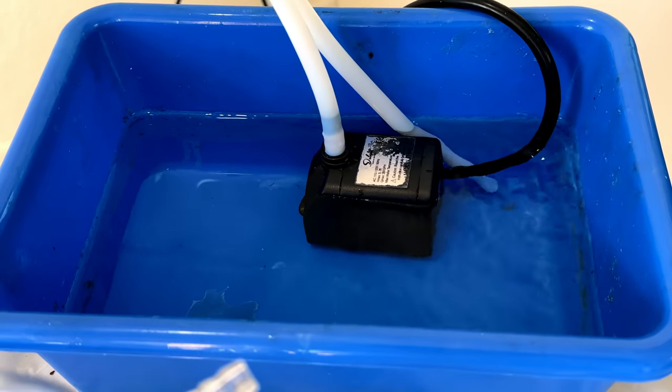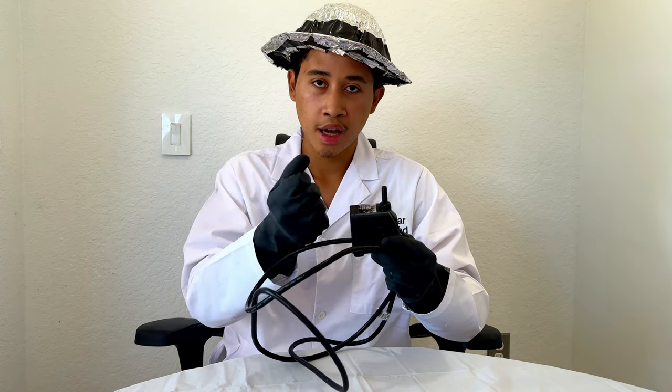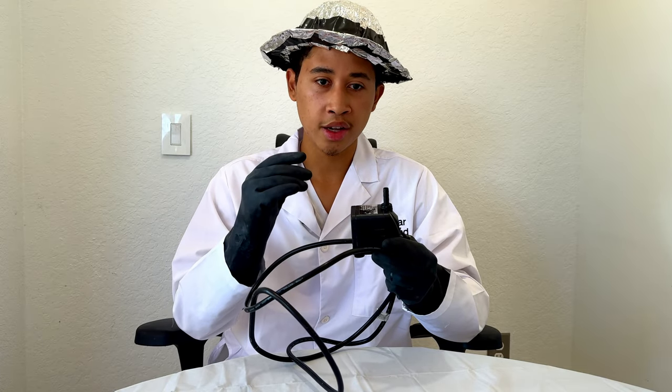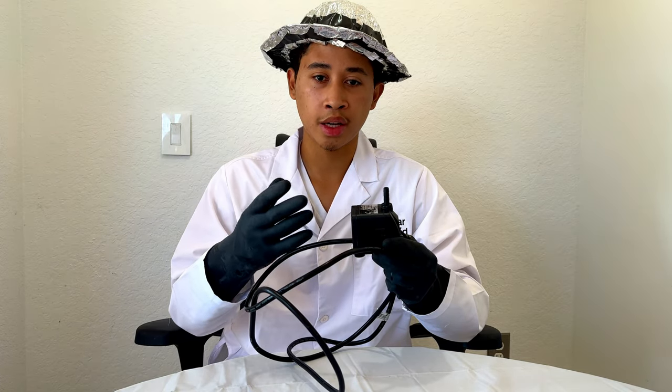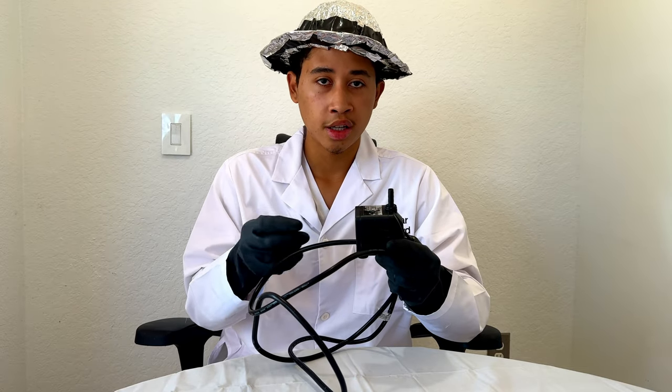This pump shoots 200 gallons per hour, which is more than enough speed for cool water to flow into the condenser and pull out the heat. This allows your product to condense fast and for long periods of time. As the water runs through, the vaporized product in the condenser will heat up the water, causing the condenser to run at lower efficiency. That's why you'd want a fast pump to pull out the heat as fast as possible, so your product will not be lost to vaporization.